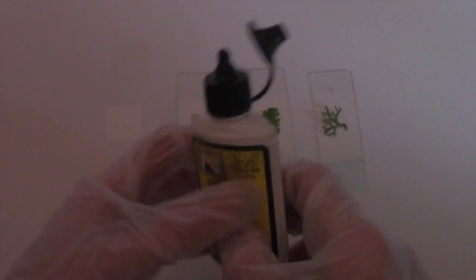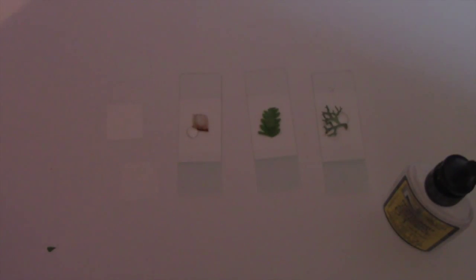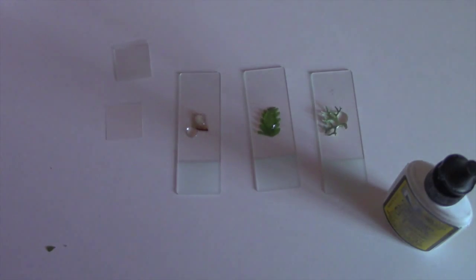First of all, put a little blob on each slide — just a small amount, because it really spreads out. Be warned, you only need a few drops. We have three cover slips to do. Put the glue on these three slides and let them dry — it'll be easier to see the specimens once dry.